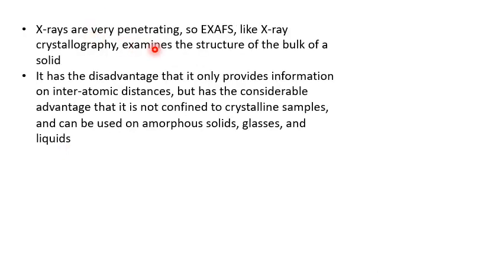X-rays are very penetrating radiations. So EXAFS, like X-ray crystallography, examines the structure of the bulk of a solid, because X-rays can penetrate inside the atom. It has the disadvantage that it only provides information on interatomic distance, but it has the considerable advantage that it is not confined to crystalline samples and can be used on amorphous solids, glasses and liquids.